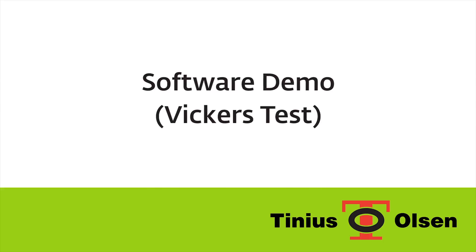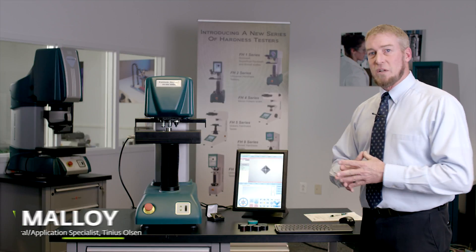What you see on the screen here is a Vickers test. This is a typical Vickers indentation.